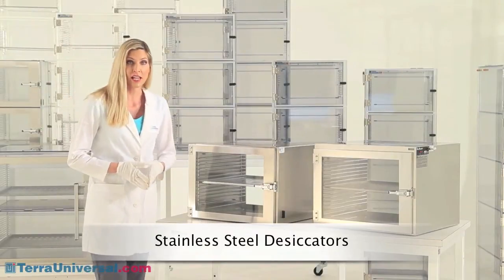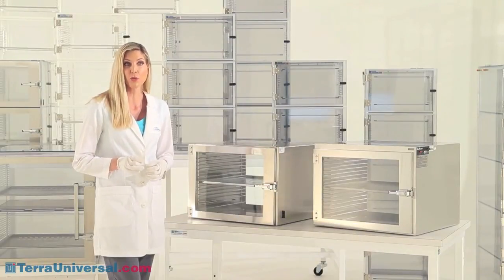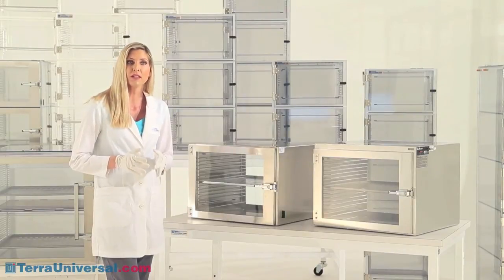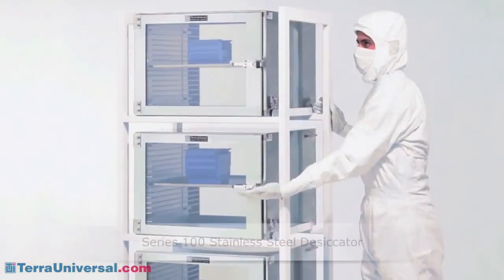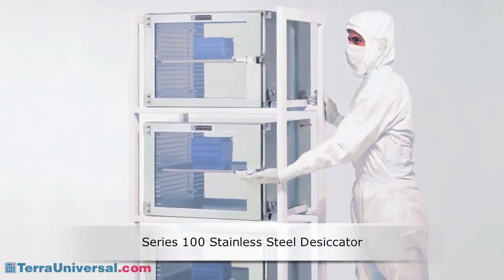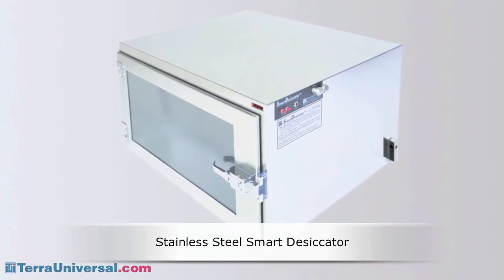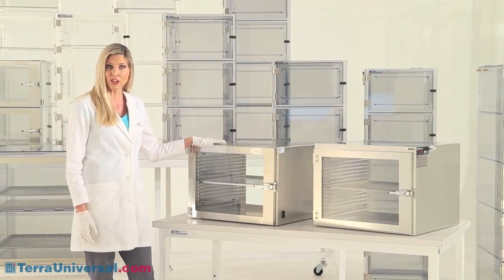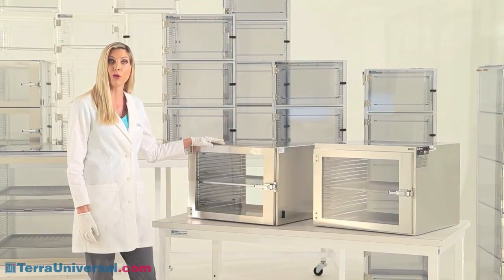Terra's stainless steel desiccators provide an effective moisture barrier that maintains humidity set points below 10% RH while minimizing nitrogen consumption. These are the recommended systems for your most critical low humidity storage requirements, and they also provide unsurpassed durability. The standard material is 304 stainless steel; 316 stainless steel is also available, and all chambers can be electro-polished to meet the most rigorous cleanliness requirements. Terra's simplest model, the single-chamber series 100 stainless steel desiccator, is available in several chamber sizes with both tempered glass and static dissipative PVC viewing windows.